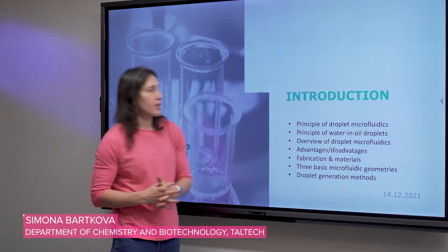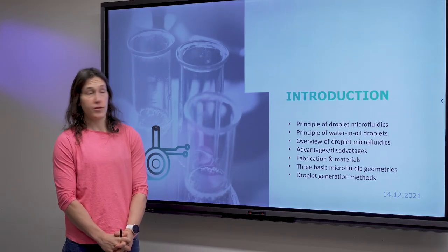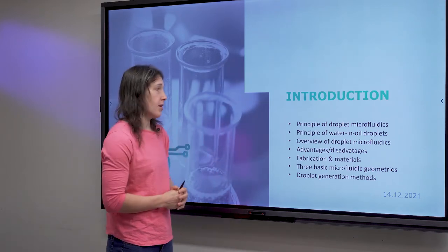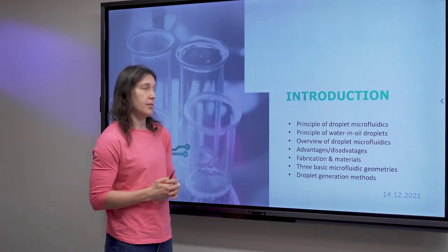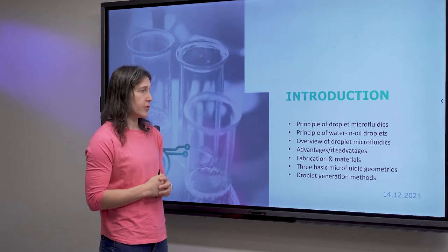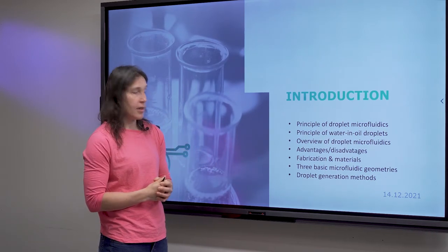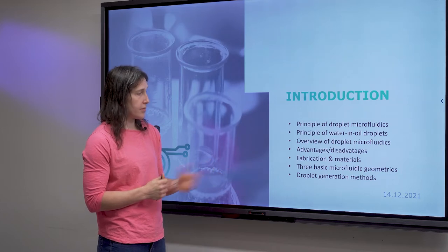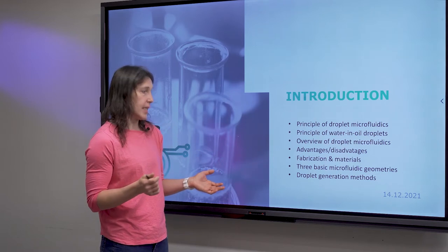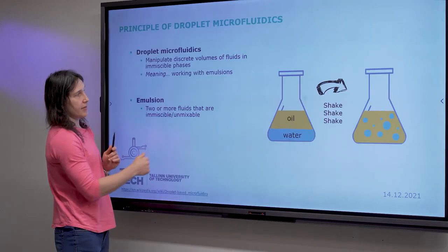Okay, so first off, we have an introduction to droplet microfluidics. And what I will introduce you to is first the principle of droplet microfluidics, then the principle of water in oil droplets, a little bit of overview over droplet microfluidics, kind of advantages and disadvantages of this method, also fabrication and materials. Three basic microfluidic geometries, and finally some droplet generation methods. All right, so let's dive in.